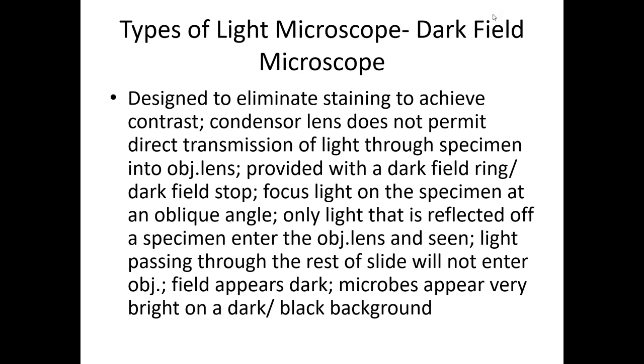So can you tell me what is the nature of specimen and background in dark field microscopy? Anybody? Type in the comment box. Now you know what is bright field microscope. Just tell me what is the nature of specimen or our microorganism in dark field microscopy. Also, what about the background of dark field microscopy? Anybody, type in the comment box. If you type this, I can understand that you know something about bright field microscopy. Anybody? Can you type in the comment box? So nobody knows what is the answer.